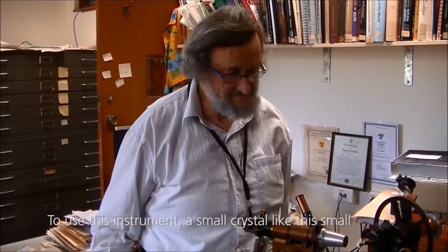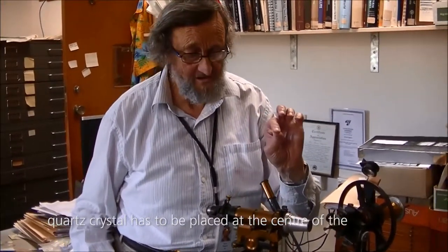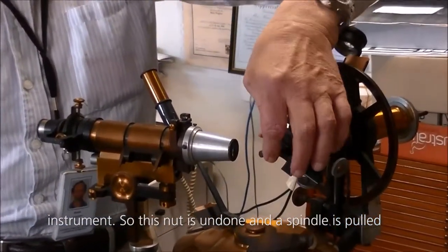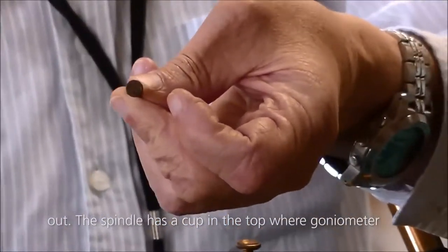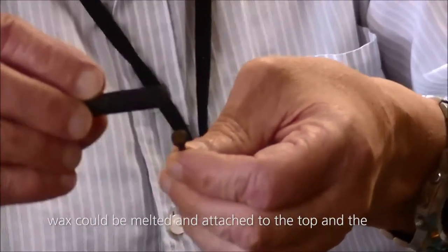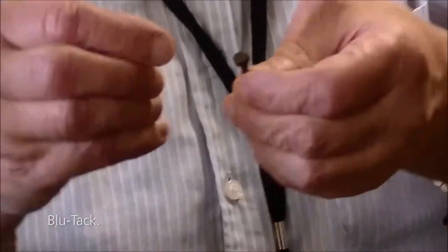To use this instrument, a small crystal, like this small quartz crystal, has to be placed at the centre of the instrument. This nut is undone and a spindle is pulled out. The spindle has a cup in the top where goniometer wax could be melted and the crystal attached to the wax, but these days we can use blue tack.